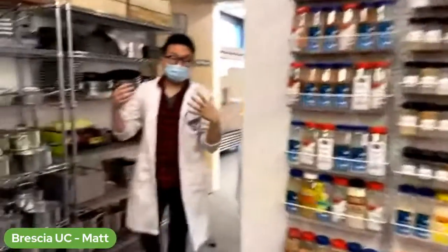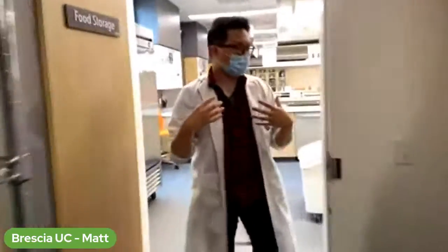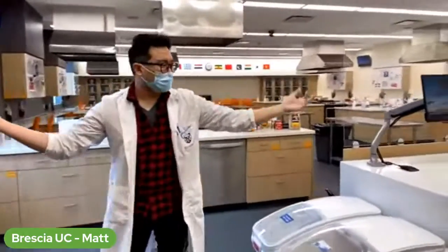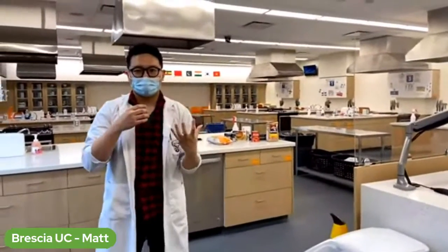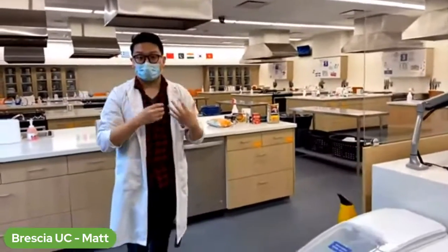And now I'm going to take you through to one of our food prep lab spaces. So this is what a lab looks like at Brescia. Now, some of you may have seen a lab before and you're expecting more of a chemistry kind of sciencey looking lab, but here we specialize in food science and food processing. And part of that is actually food preparation.